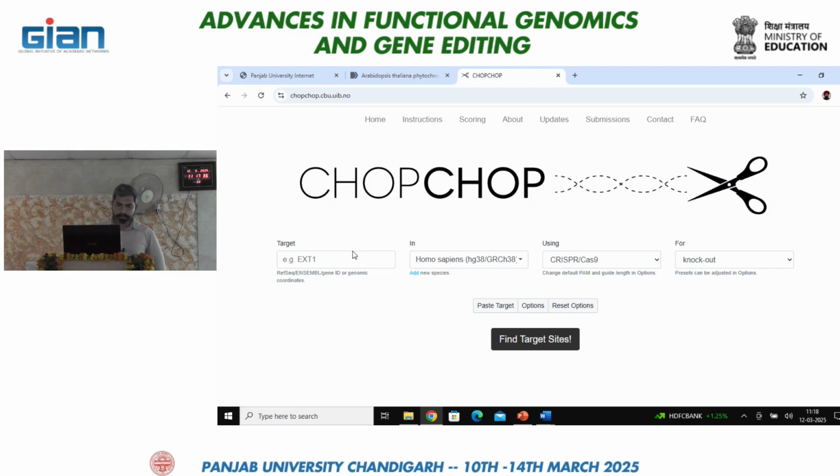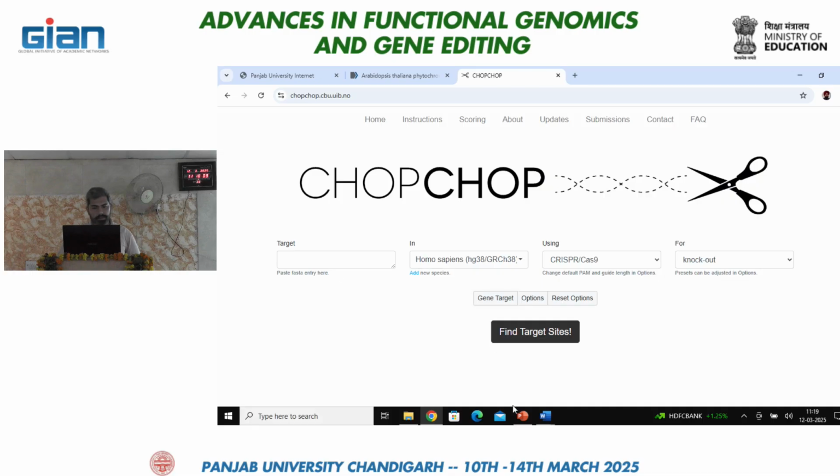So in this box, you can either paste the accession number or your target gene itself. In our case, we will paste the target gene. So we will click on this here, paste target. After clicking on this, we can simply paste our FASTA entry here. The sequence you have copied in Word or Notepad, you can just copy and paste it here.